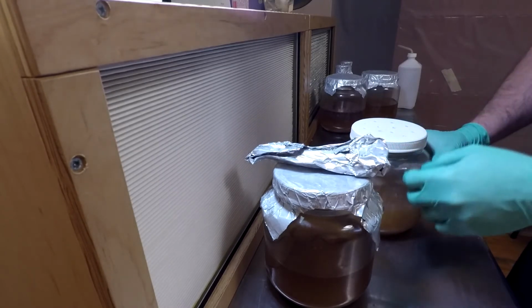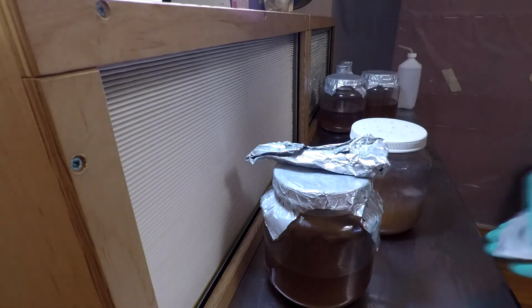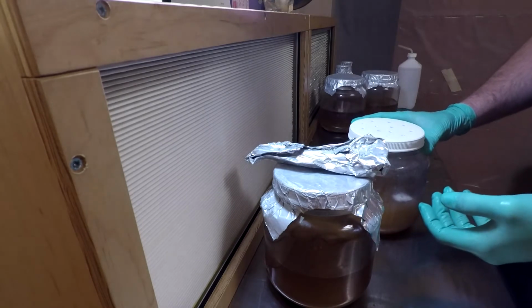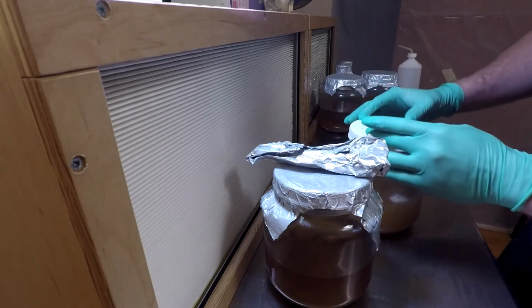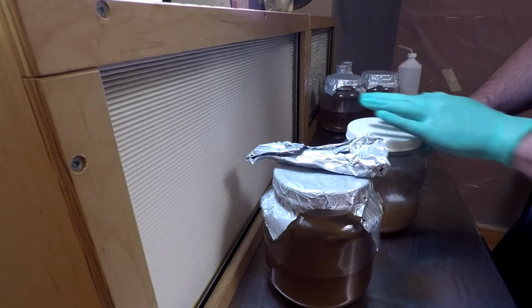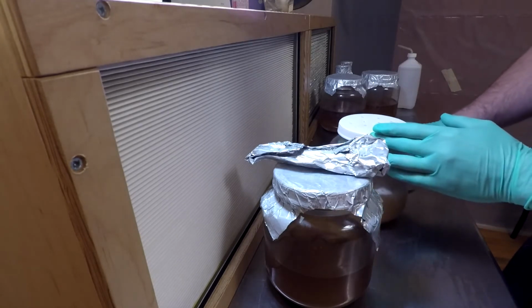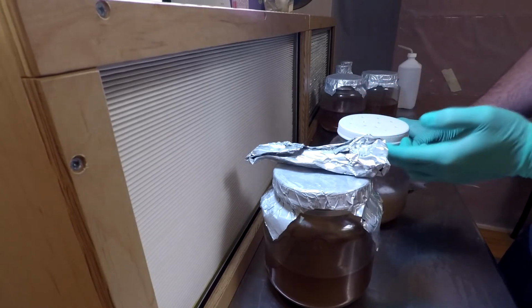The problem with these style of lids and the filters is that you always get some gap between the filter and the lid because it bows down a little bit. Of course, that's not the problem when you're using metal bands and lids, then you can put the filter part right on top. So you want to make sure you add plenty of alcohol and sterilize the area in those holes, because if you have any chance of the filter being loose in there, when you unscrew this lid, that space of air full of spores and other contamination is going to get down into your jar.